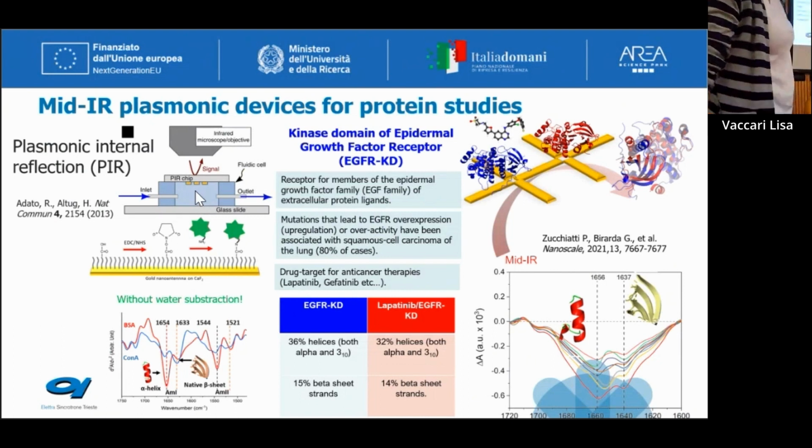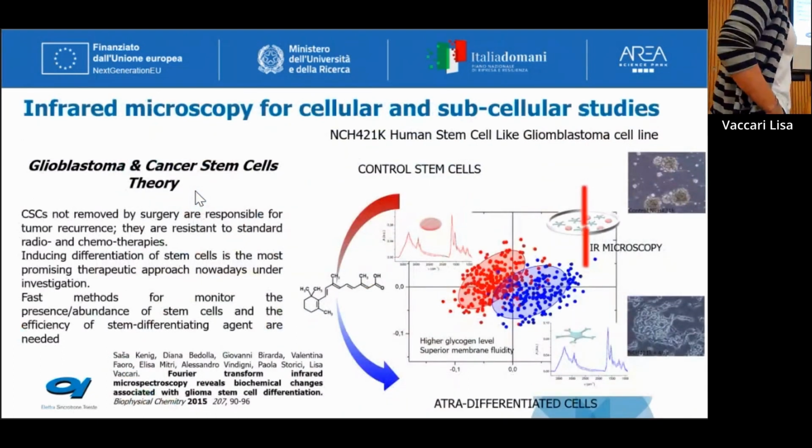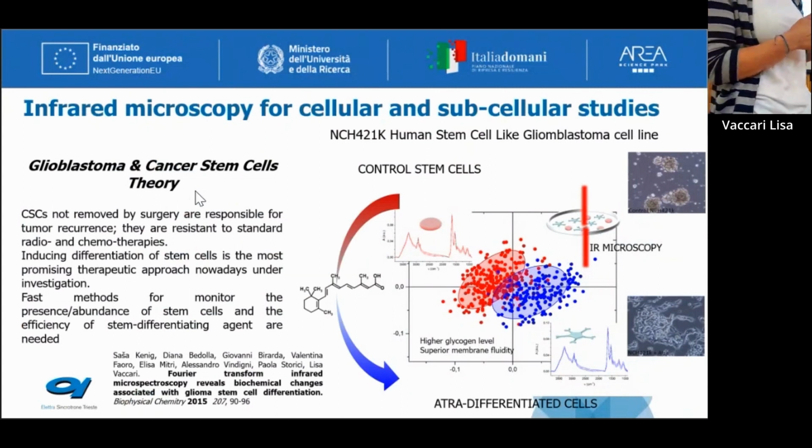For the cytology part, I won't stay longer because it's very technical, but the point is the following. Our technique, similarly to UV Raman scattering, is more on the side of being ancillary or supportive for those techniques that look at the infection problem from the phenotyping point of view.